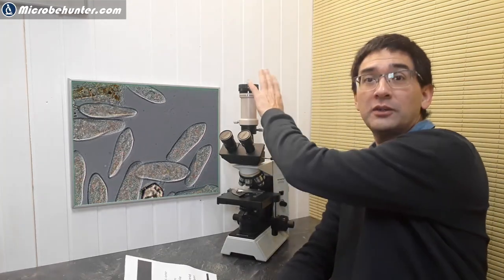I'd like to address all of these issues and give you a recommendation. If you already have a microscope with a trinocular head, a photo tube, like one over here where you can connect the camera here at the top, if you have a microscope like this and if you already have a DSLR camera, then by all means first try to get a DSLR camera adapter and connect that.